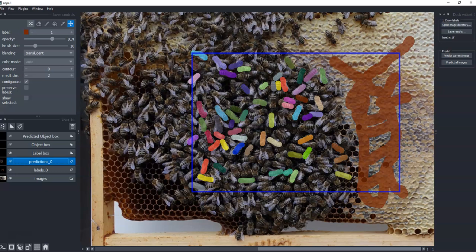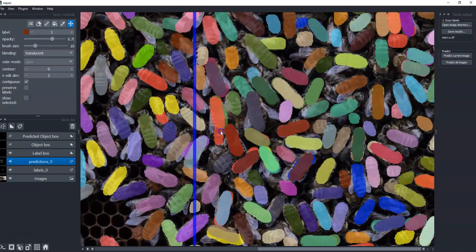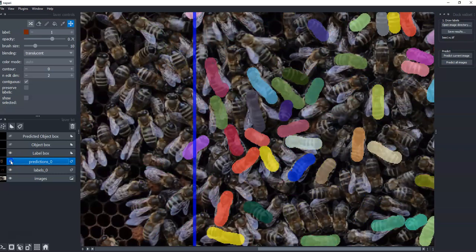So don't expect anybody to be able to totally make sense of this, but here's our sparse label, and here's the model that was trained. Not too bad, right? I think my video is going to cut me out, but that's our sparse Stardist prediction.